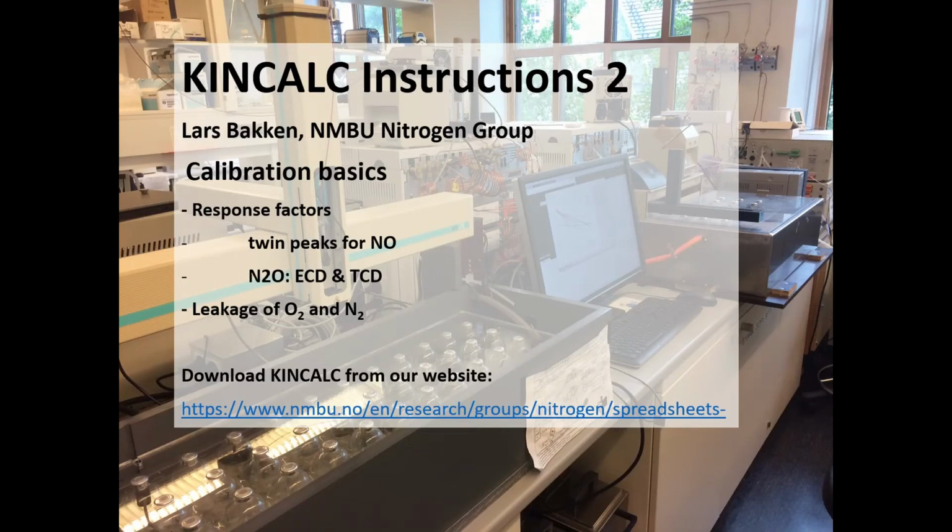This is the second of the videos showing the KINCALC operations, and in this video I will teach you how to calibrate your spreadsheet, going through the response factors for the different gases, twin peaks for nitric oxide, the use of ECD and TCD for N2O detection at low and high concentrations, and how you compensate for the leakage of oxygen and nitrogen and the loss of sampling.